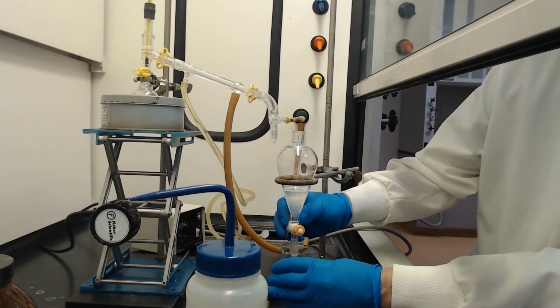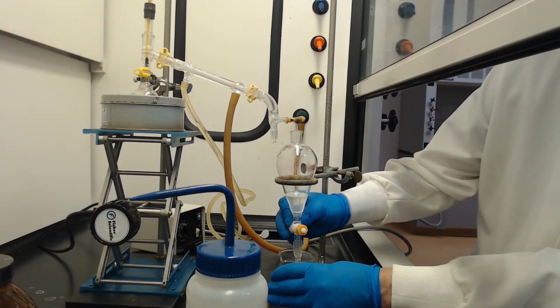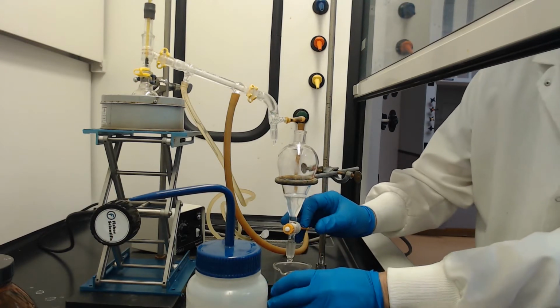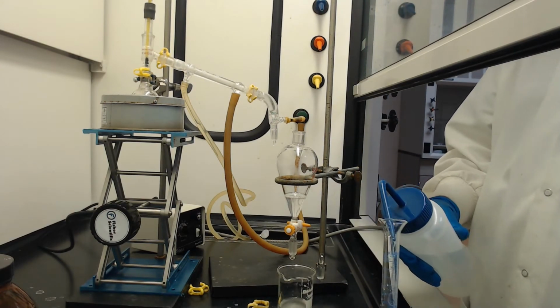All right, there it goes. It's coming down, coming down. So I do it quickly at first, and then I slow it down and get that last little drop by drop. And there it is. All right, and then it says to do one more wash with our DI water, our third wash.